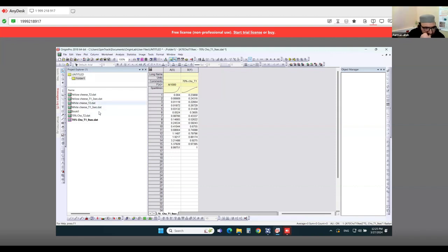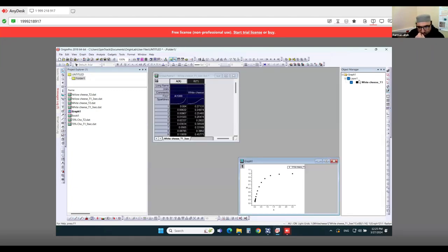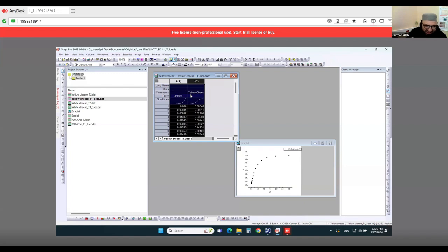Now starting from this one, first I want to plot this. Okay, and then you can also do it this way: minimize, then go to the second one and select them. I have experienced one thing: you see that when the cursor is here, you cannot bring it directly, but when you go here, you can bring it.